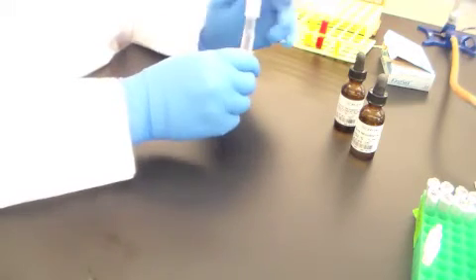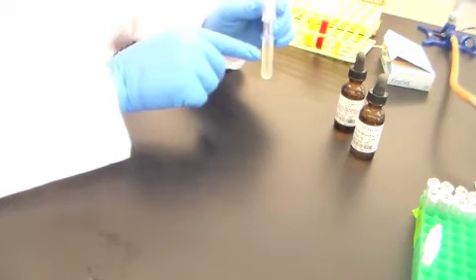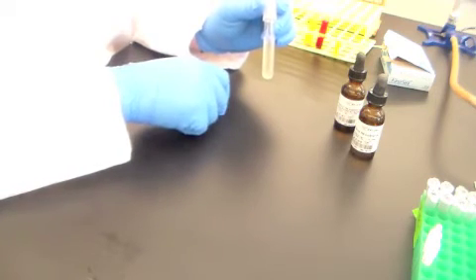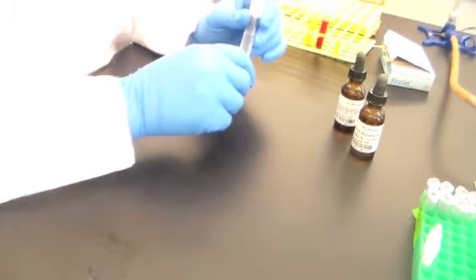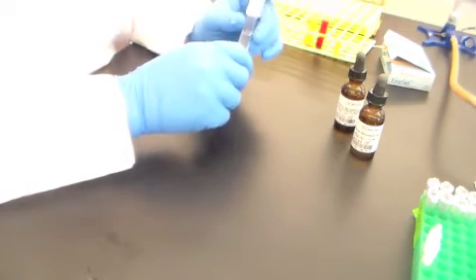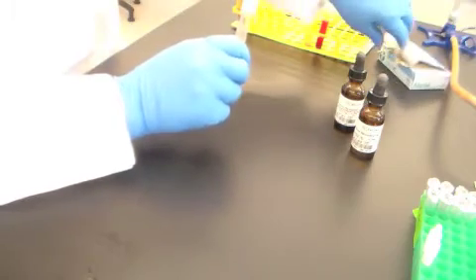But remember that these two reagents, nitrate A and B reagents, are going to create that azo dye only in the presence of nitrite. They're exquisitely sensitive for nitrite. So if the bacteria have already used up the nitrates and the nitrites, you're going to get a false negative. So the way that you determine whether it's a false negative is that you will now take a toothpick.